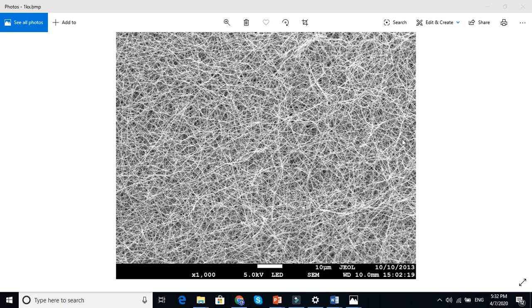In this video I am going to explain how to interpret SEM or FE-SEM micrographs of nanofibers. You can see this is a mesh of nanofibers. The scale is in micrometers.